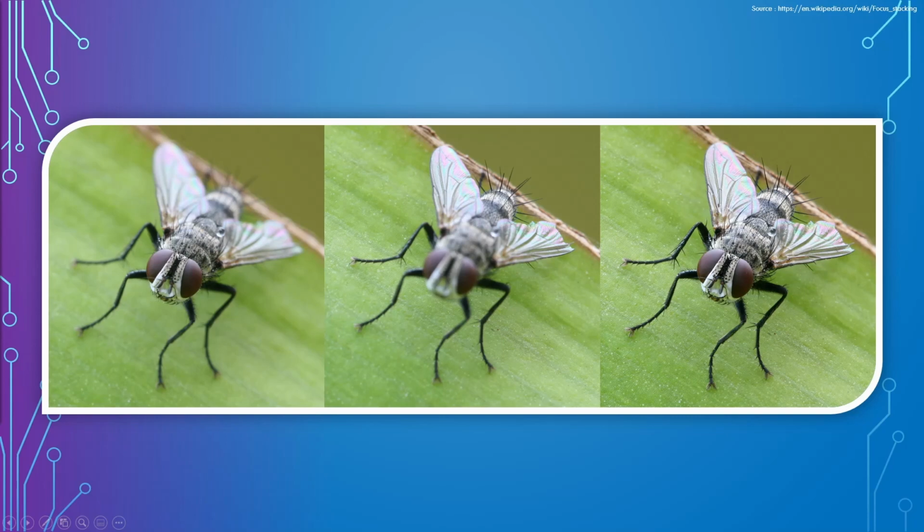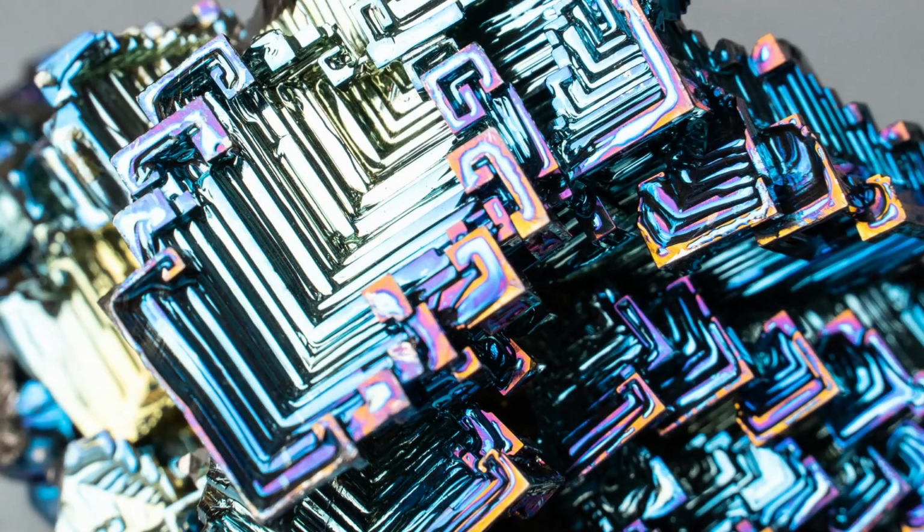And we are going to be doing this with bismuth samples. Bismuth is an element, and it sits close to lead on the periodic table. It's very, very heavy. And bismuth exhibits this kind of hoppered crystal structure.